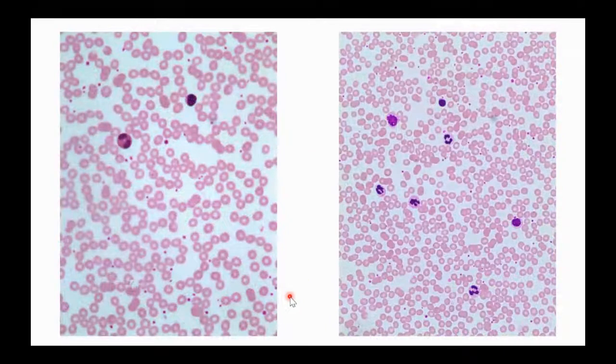All right, we can identify this type of tissue. What are we looking at here? Two pictures of something. What do we got here? Yeah, Kira's naming the cells that we see here. Totally right. We are looking at a blood smear.